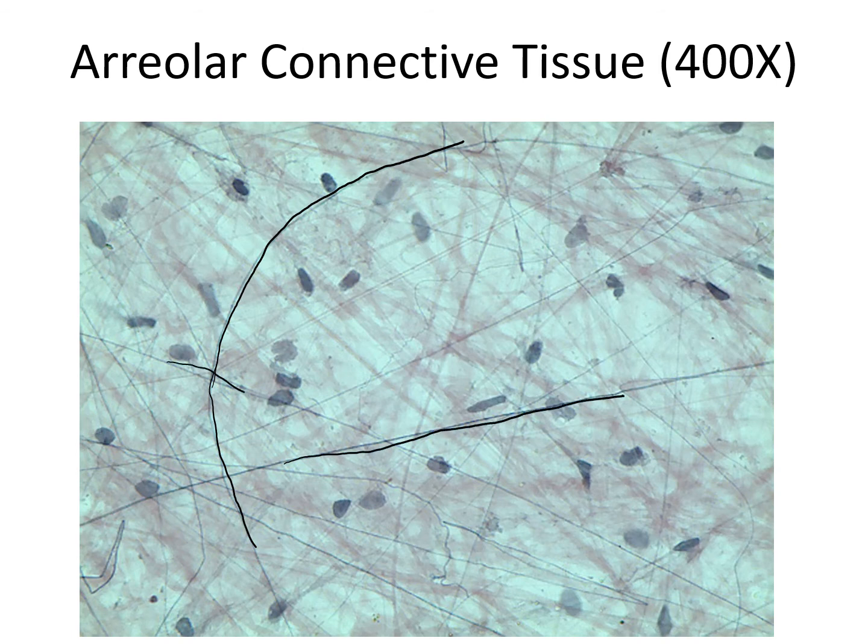Or this one, those are elastic fibers. Now the thick fibers over here, those are collagen fibers. And cells, like this cell, and this one, and that one, those are fibroblast cells. Also, you see white blood cells, so they're bigger, like this one.